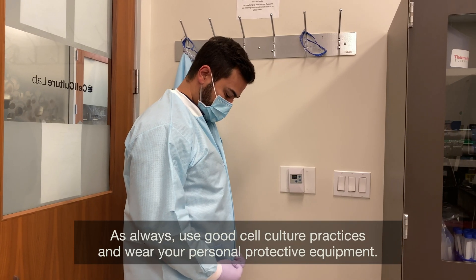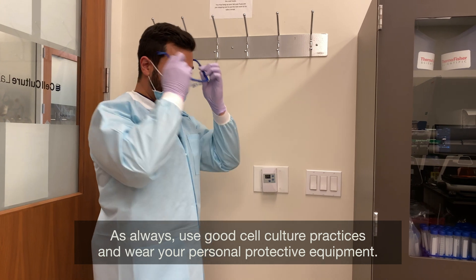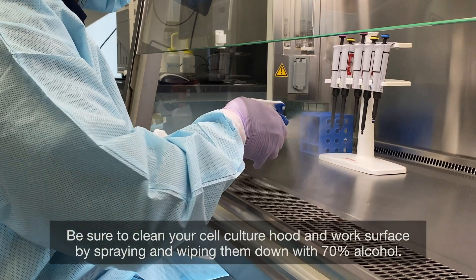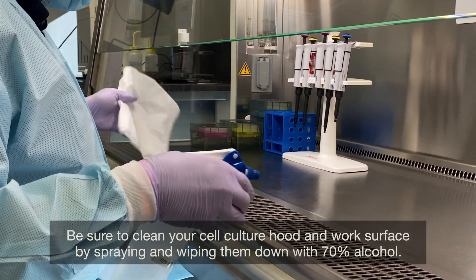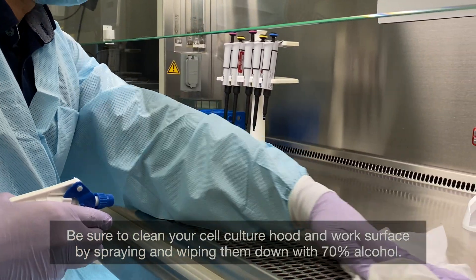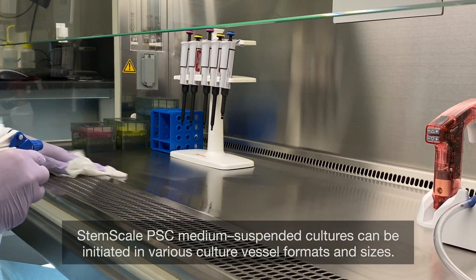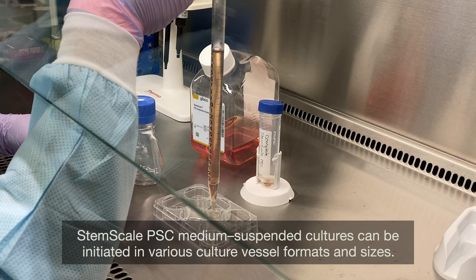As always, use good cell culture practices and wear your personal protective equipment. Be sure to clean your cell culture hood and work surface by spraying and wiping them down with 70% alcohol. StemScale PSC Medium suspension cultures can be initiated in various culture vessel formats and sizes.